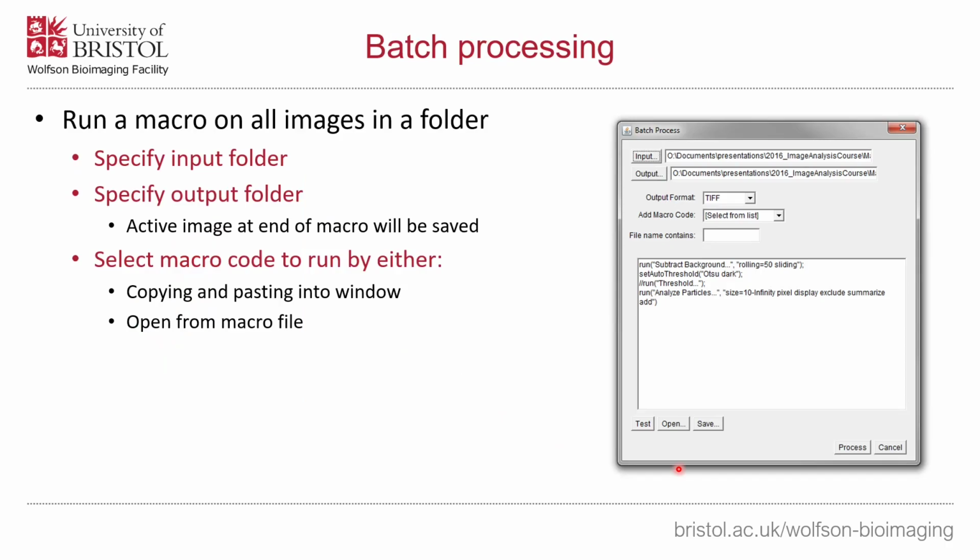And just to end on a slightly simpler note, we've also got batch processing capability. So at this point now, you've hopefully got all the components that you need to create your macro. So everything from using variables and numbers, arrays, and string text, being able to combine those mathematical operations using concatenation, to doing more complex sort of optional things and loops, so conditional statements, while loops, for loops, and so on.